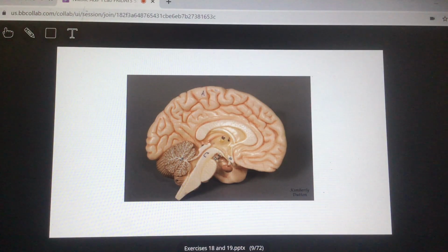All right, guys, are you ready? Corpus callosum, go. That's it. Awesome. Big C, big C, big C. All right, are you ready? Fornix. Go, go, go. Fornix. Kind of little c, right? Think about it a little bit like that. That's right. Now, don't go too far out. Not in the middle there, guys. So the fornix is just the white part here. You guys see that? Just that part. Okay? You're going to see this in the sheep as well.